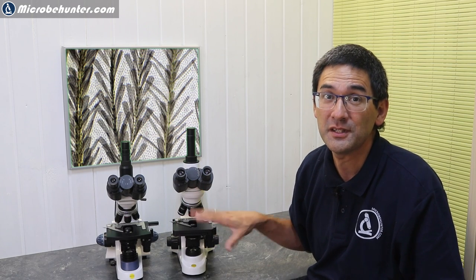Otherwise, those optics are not compatible. When making a purchasing decision, you might consider also if you want to upgrade your microscope with different optics, and then you must make sure that you are able to obtain the same optics of the same series. I was informed by the company that they will expand their accessories, so I expect that hopefully in the future they will also make additional objectives available, but this is something you have to check when you make a purchasing decision.